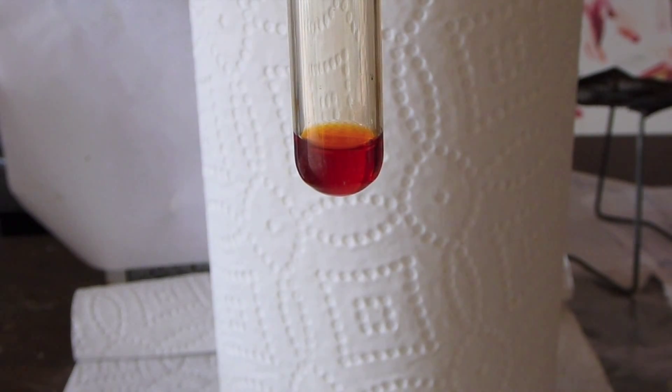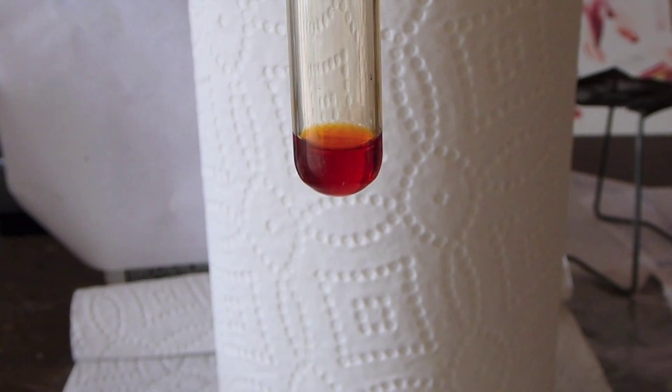Now I'm going to add a couple drops of a saturated solution of sodium persulfate. Persulfate is a very strong oxidizer, and it is going to oxidize the ruthenate all the way up to perruthenate. So then you're going to have a solution of pure perruthenate.